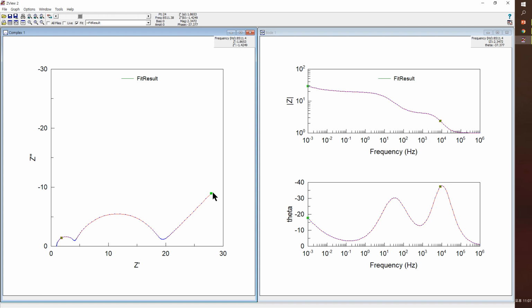So we could move this one, and you can find another green square. So please tap the spacebar. Then red boundary moves from this one and this one. Right now you could move this green square. So please click the left arrow button or right arrow button, something like that.